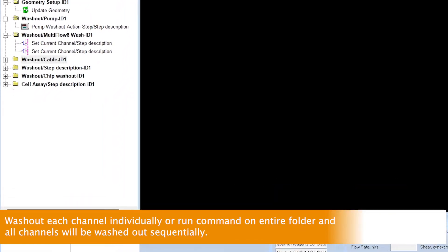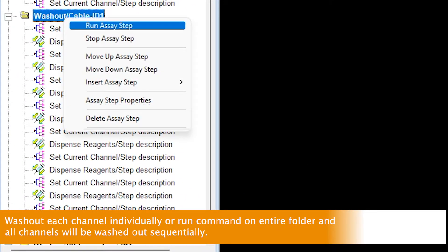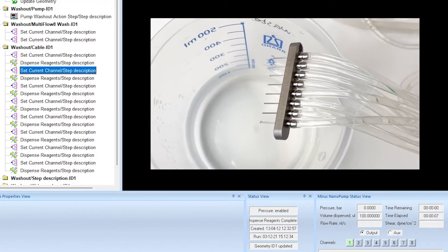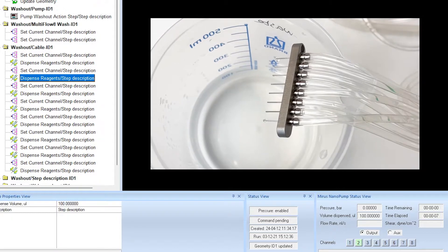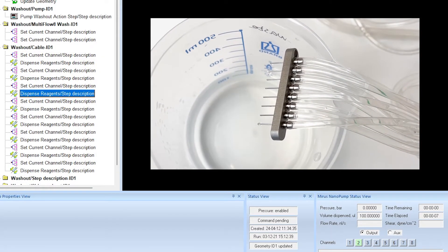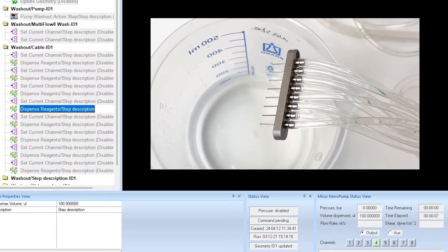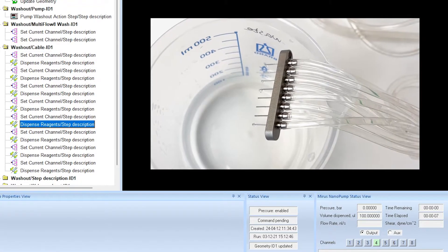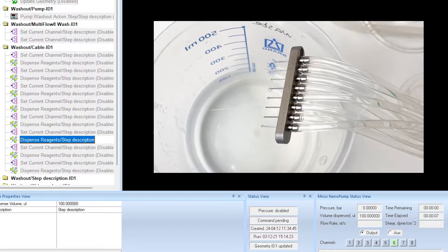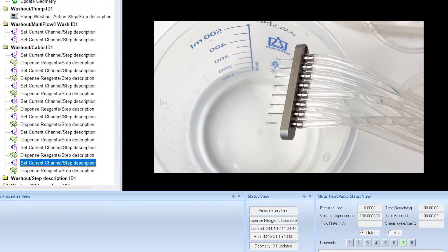The next step is to wash out or prime the 8-way cable from the Multiflow 8. Click Wash out cable. This folder has an on-off command to open or close each channel and a command to dispense reagents through each channel. Wash out each channel individually or select Run assay step on the entire folder to wash out all channels sequentially. This washes out each channel of the 8-way cable with 100 microliters of PBS, which can be seen jetting out of the output as shown.